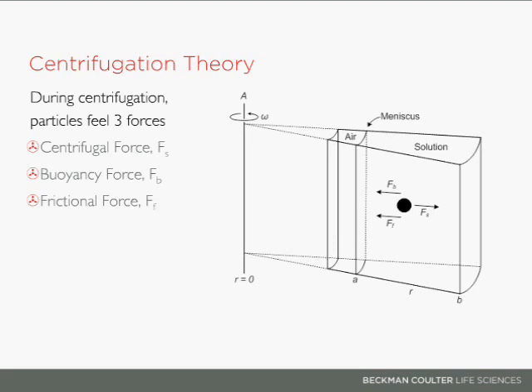There's also a buoyancy force that's an opposing force to the centrifugal force. This is also known as the Archimedes force. It can be thought of as the solvent molecules being displaced by the sedimenting particle. They have an opposing force. In regular day-to-day life, you can imagine it as if you push a block of wood down into a bathtub, there'll be a strong opposing force from the more dense water molecules pushing back against the less dense wood.